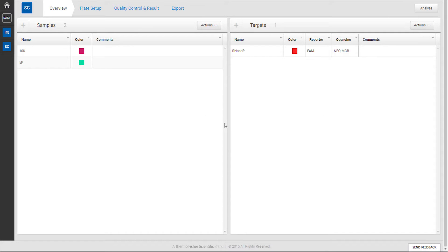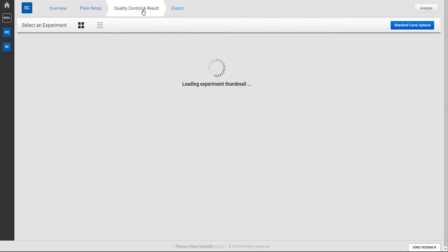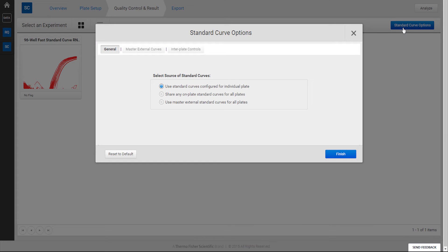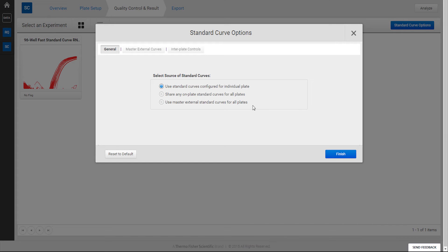To access the new options, open a Standard Curve project and click on Standard Curve Options under the Quality Control and Result tab. Under the General sub-tab, there are three options.